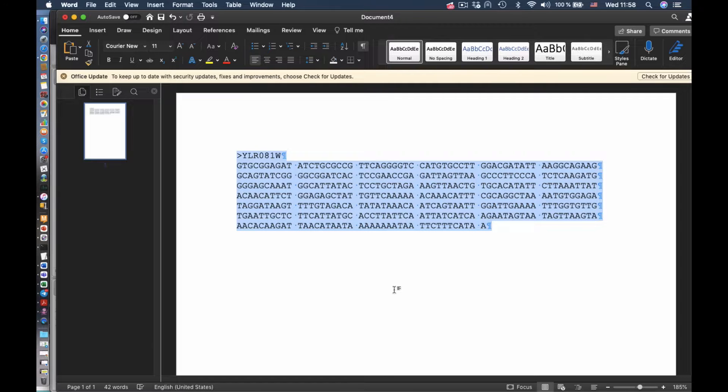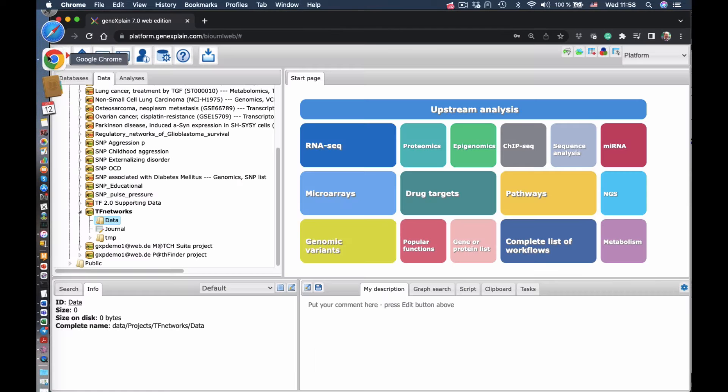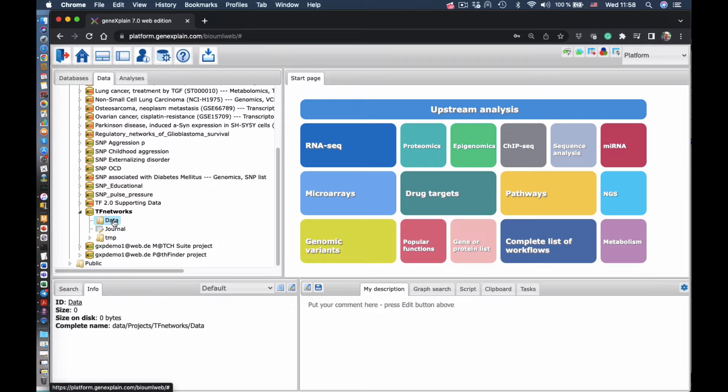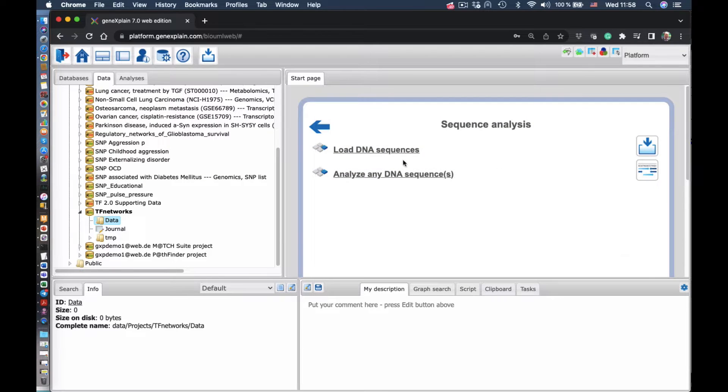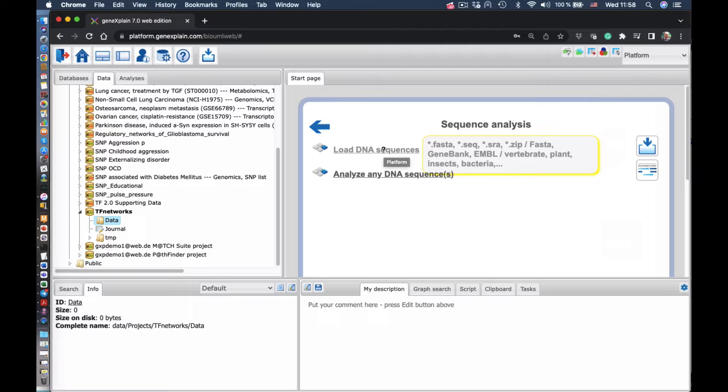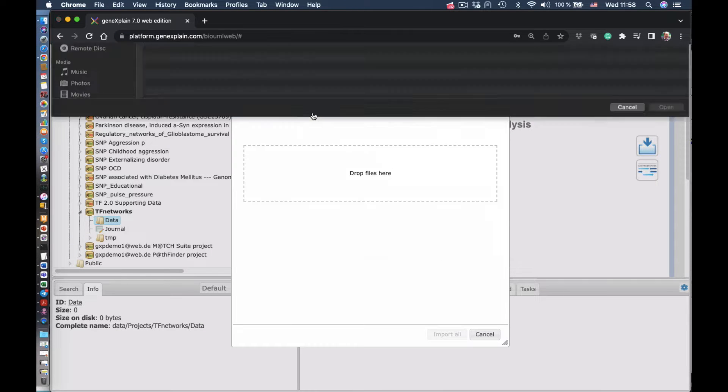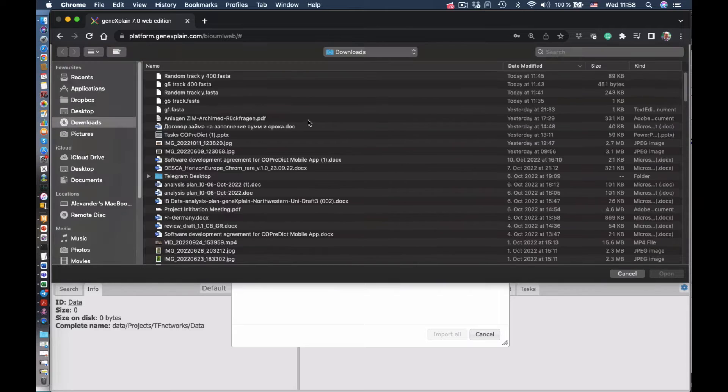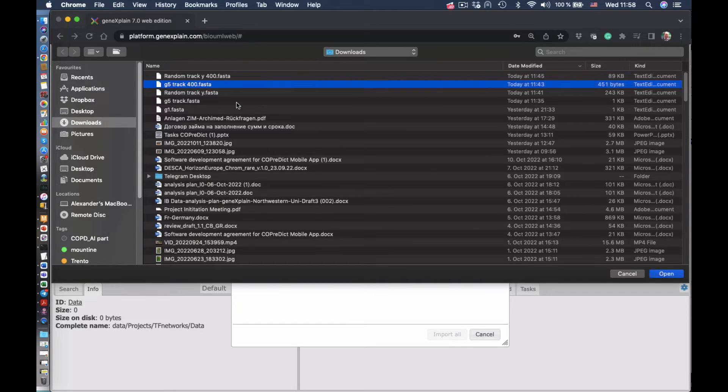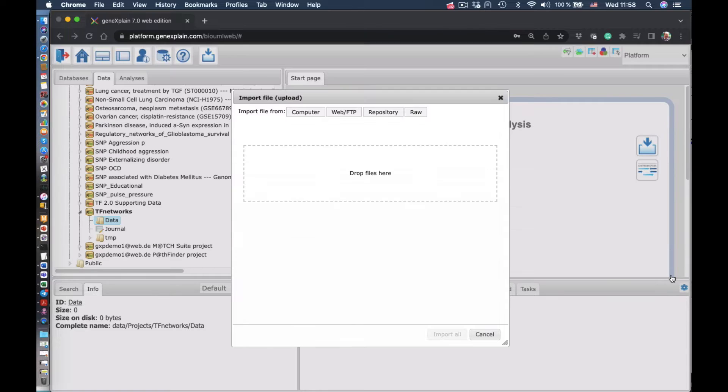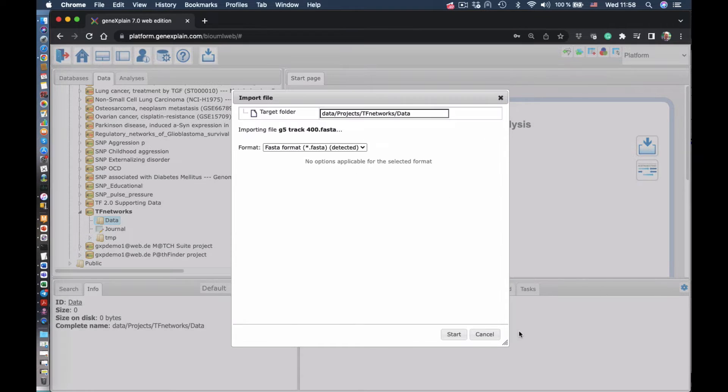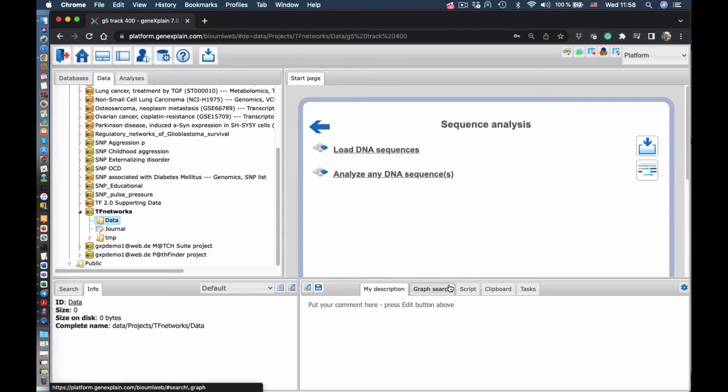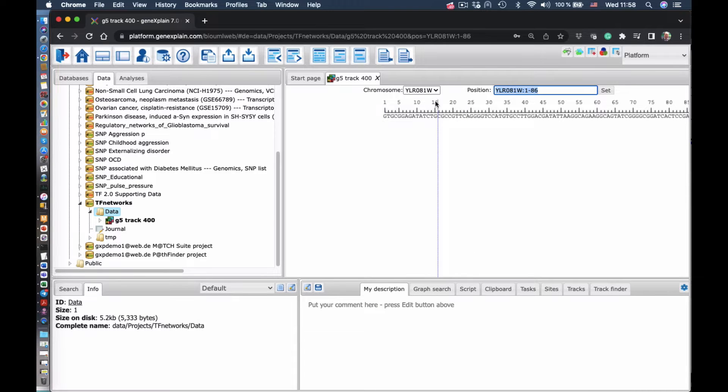Here we see the accession number of that gene in yeast. And then we go to platform and we go to sequence analysis. Here we go to load DNA sequence in FASTA format. We find our file in our computer. We open it so it's automatically loading into the server. We start the import. So we have this file in the system.